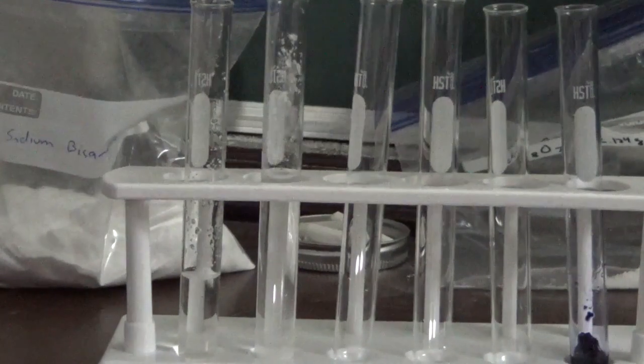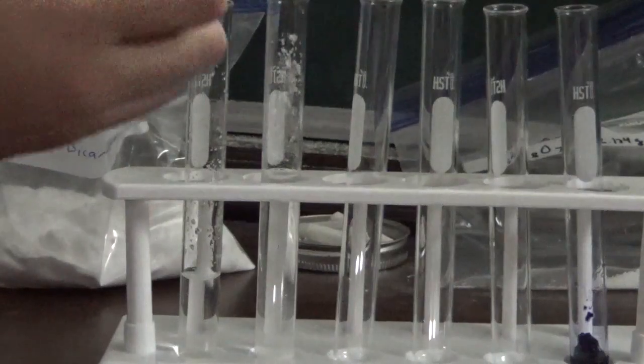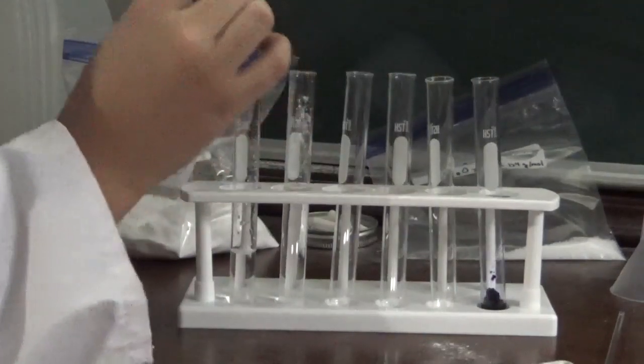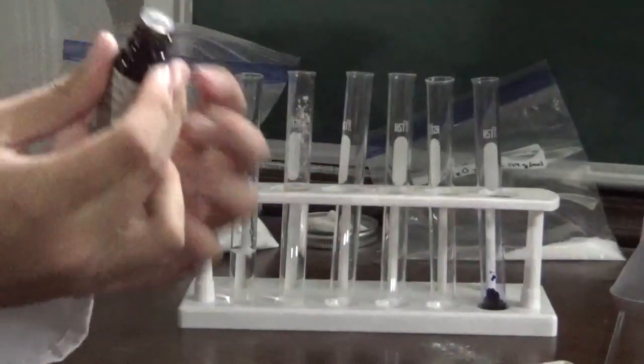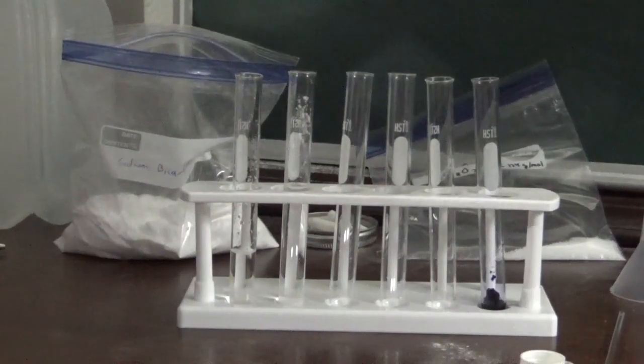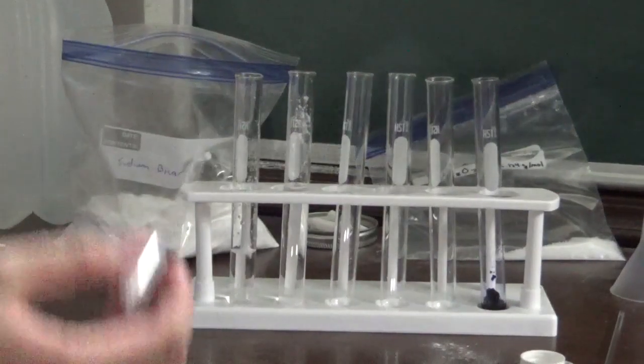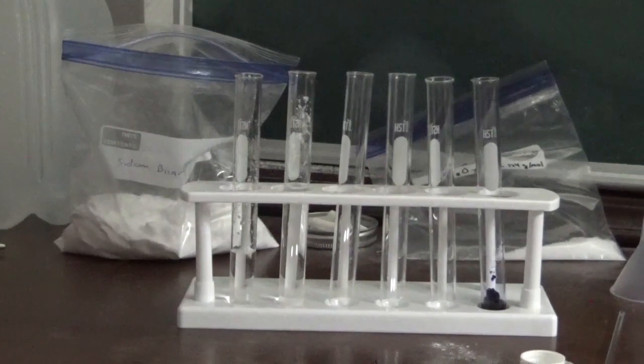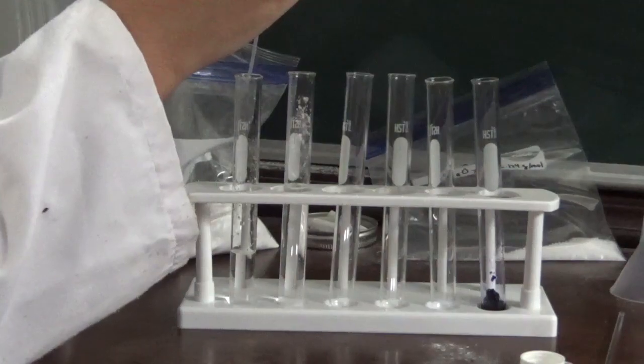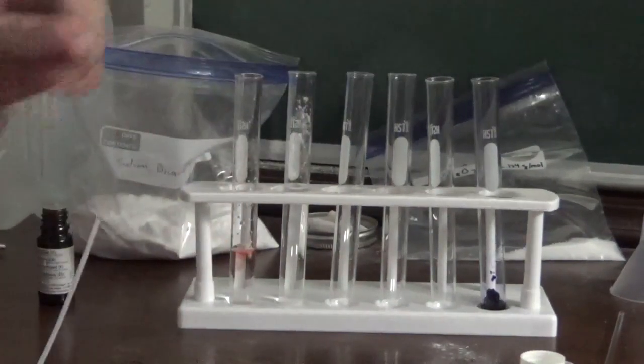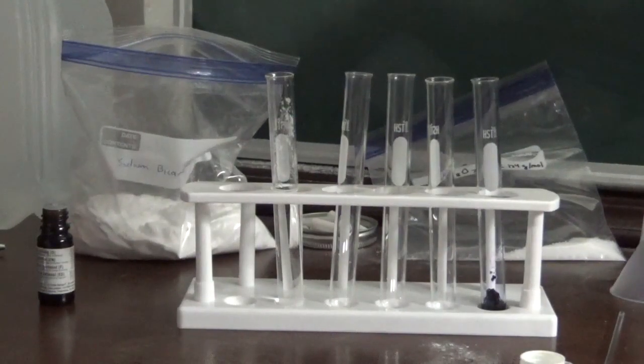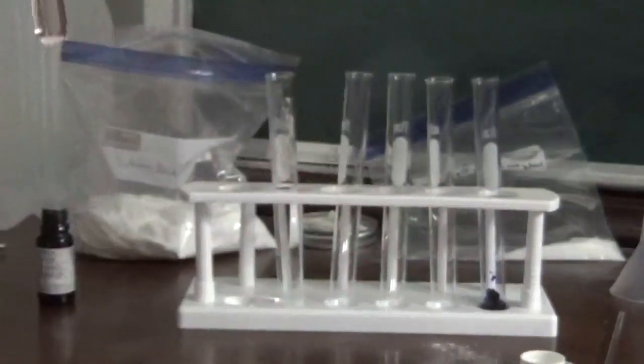And now, if we take our litmus solution, we can observe what happens when we add it to the different test tubes. Here we go. First is our acid solution. All right, I don't know how to get this stuff out. Yeah, so, oh, I guess that's how you do it. Okay, well, I have some litmus solution in this pipette. There we go.